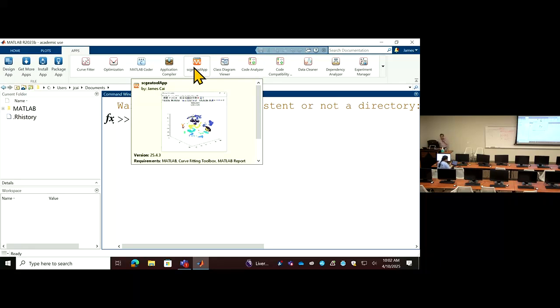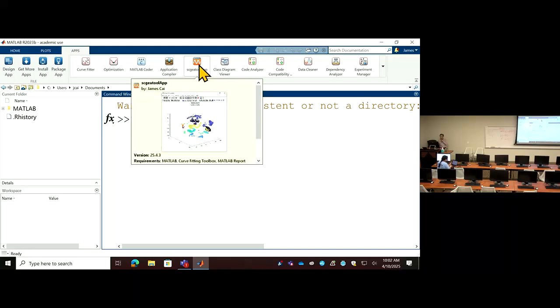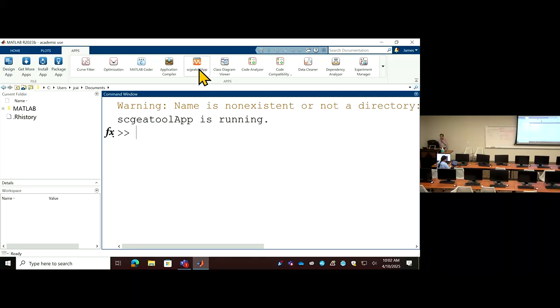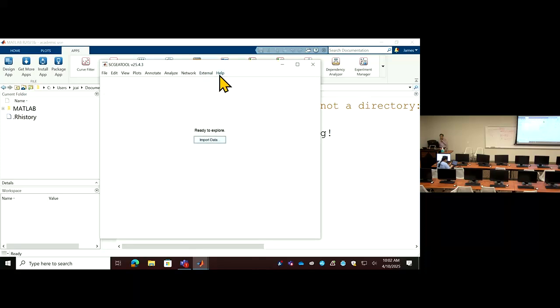Okay, so you can take some time to update the package. What I will do from now on is to start the program by clicking this shortcut in the apps. You should be able to find this after you install. Then from here, you just do check for update. When you see yes, the program should download and restart the interface automatically. Then you should be done.